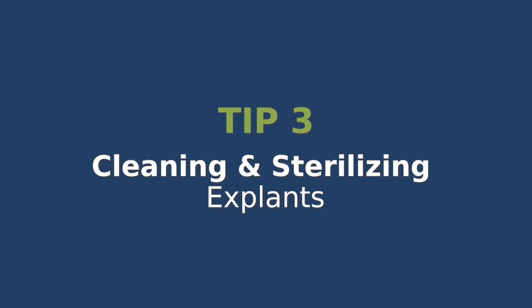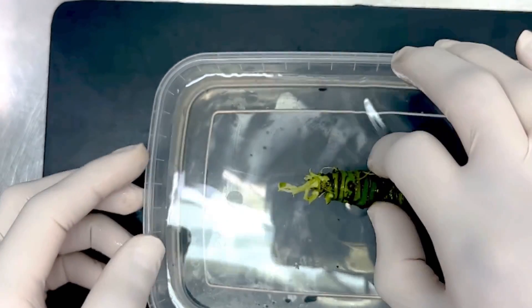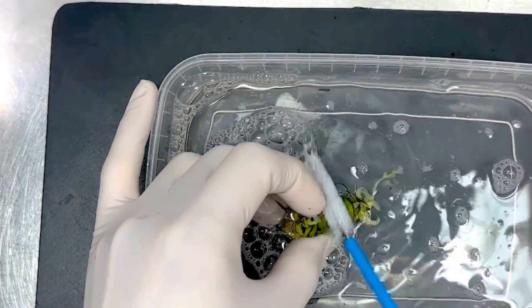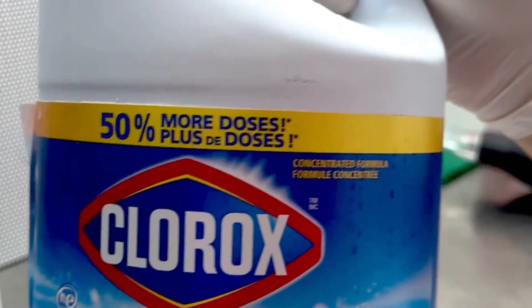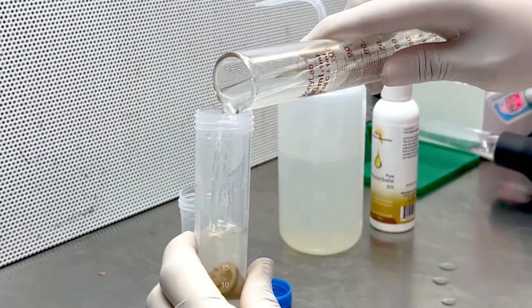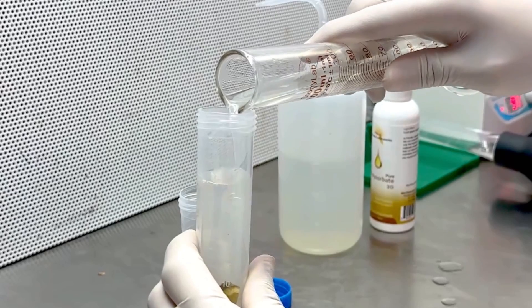Cleaning and sterilizing explants. Before we place our plants in the media, we need to sterilize them. Start by washing the plants with soap and water — use a brush if the explants have a lot of soil. Then sterilize them with a 10% commercial bleach solution. After 15 to 20 minutes, rinse the plants 3 times using sterile water to remove any bleach residue. This is essential to keep your cultures free of contamination.